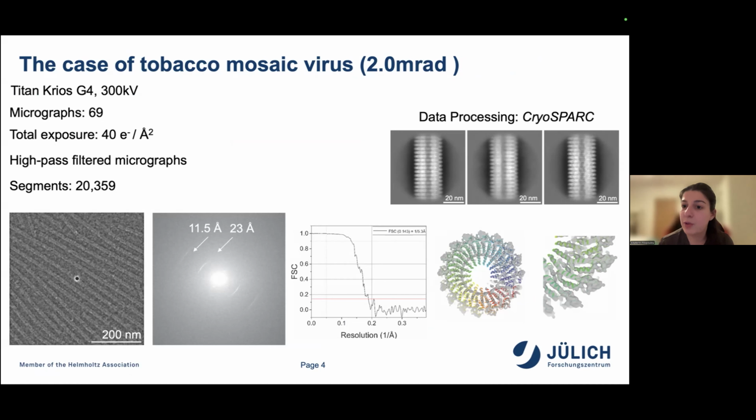For processing, I have used cryoSPARC, and I have selected these 2D classes, and the total number of segments was approximately 20,000. At the end, I proceeded with helical refinement, and the final resolution was 5.3 angstrom. You can see that the model has been really well fitted in the map. And also from the 2D classes, you can see some really good 2D details of the structure.